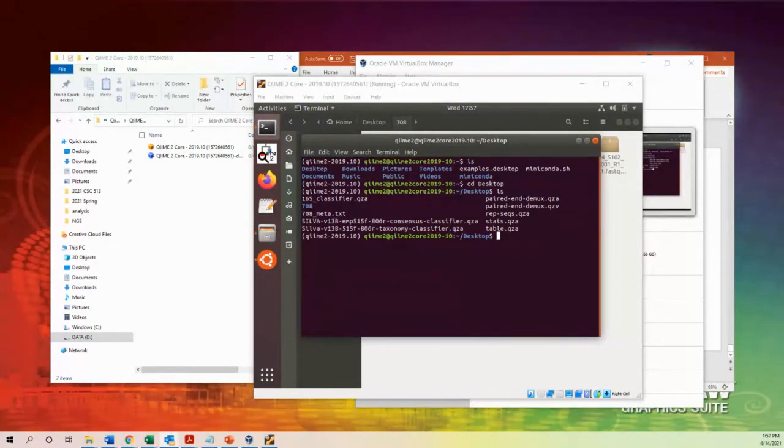I'm sorry, I'm still having trouble with the terminal. When I put in the top part it comes up, but after the next green line, I can't get to the cd desktop. When I type that in, it comes up as no such file or directory. When you type ls, did you see Desktop here? Yes. Okay, then you have to type cd space, and this has to be a capital Desktop, and then hit enter. Okay. Thank you. You're welcome.